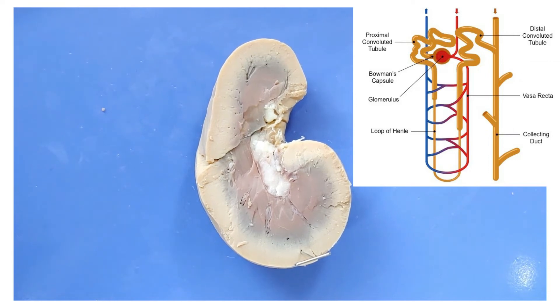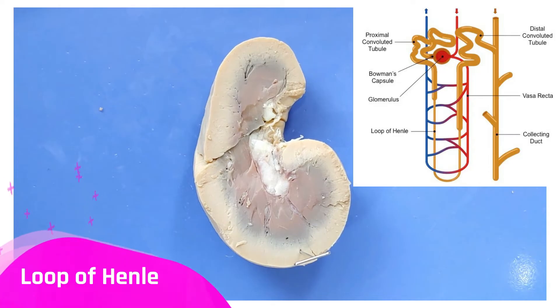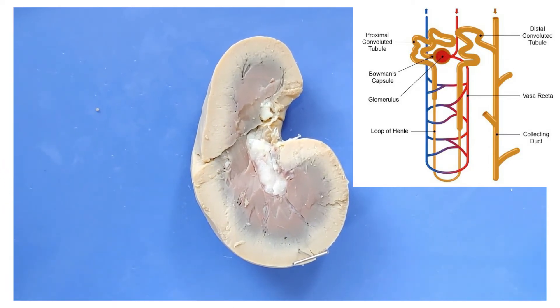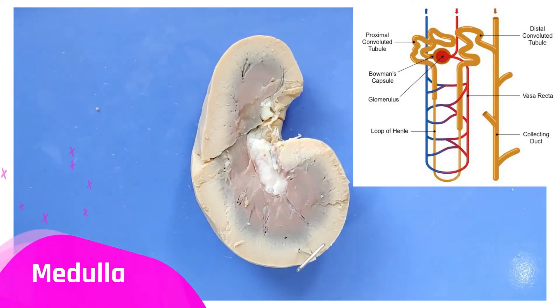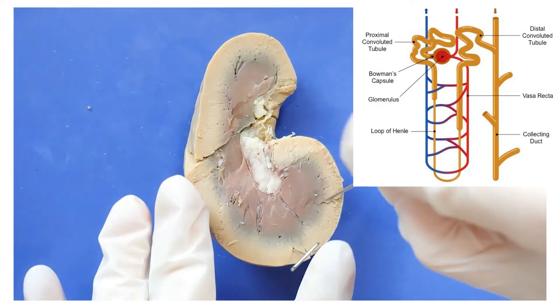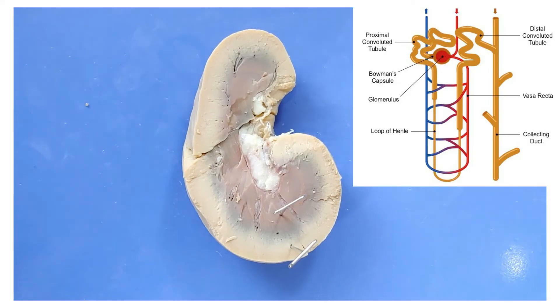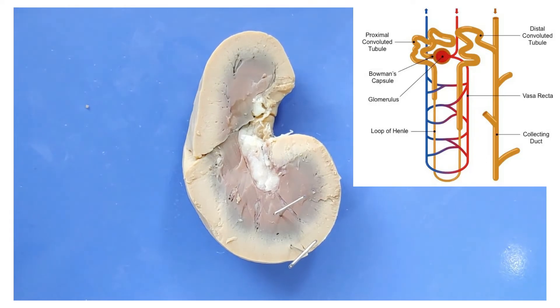After that, it passes through another segment called the proximal tubule, after which it enters the loop of Henle. The loop of Henle is a literal loop, and this is where we get into this reddish layer below the cortex called the medulla. I'll put a pin here too. The loop of Henle is basically where the body goes 'whoops, we overshot,' and takes back a lot of the water and ions from the filtrate.